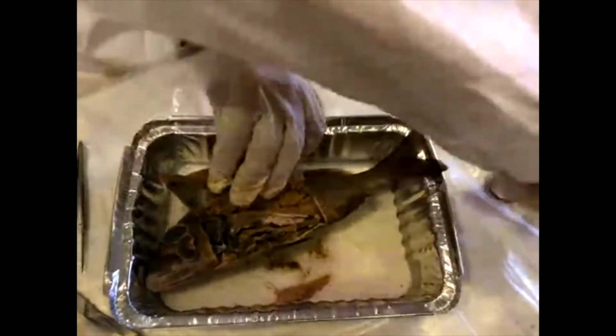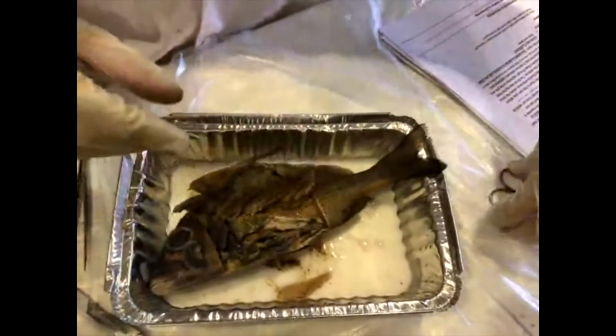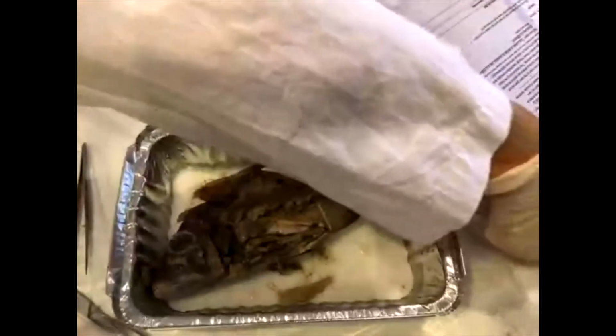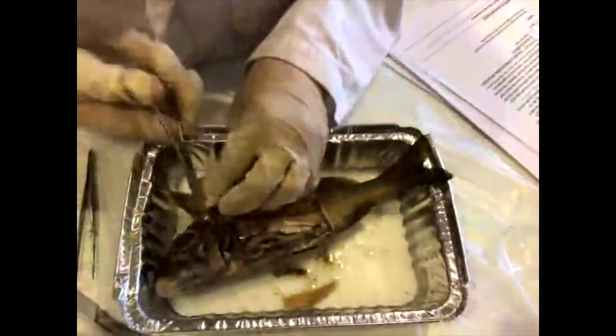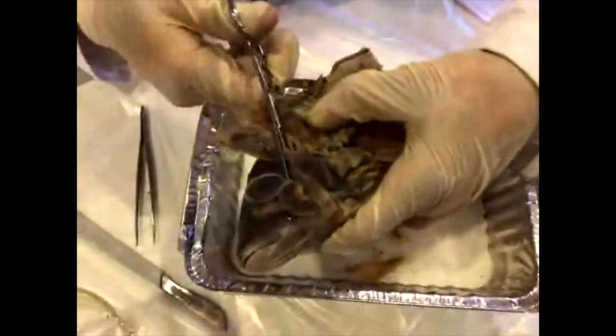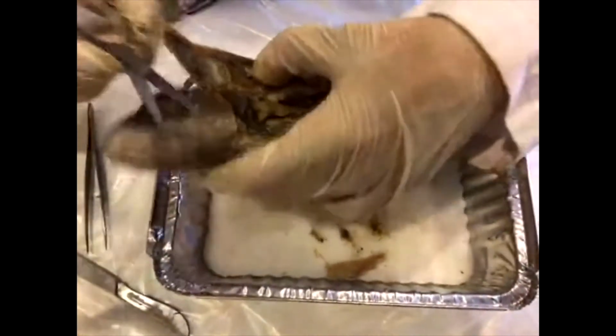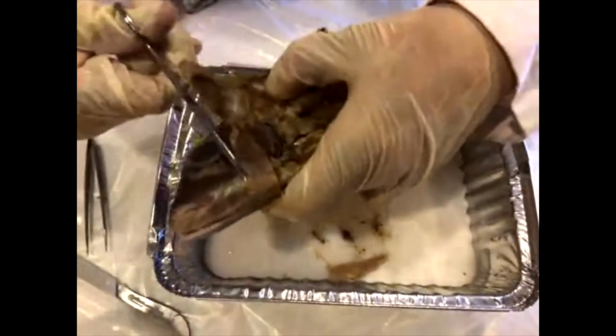But I'm just going to remove all of these and see if we can find the heart, because the heart is actually located right behind the gills. One reason is probably because then the oxygen has to travel less area in order to get to the heart, where it can then be pumped around the body.